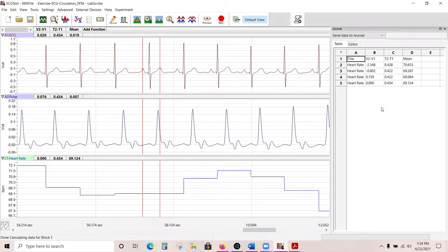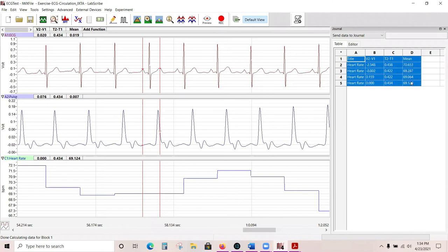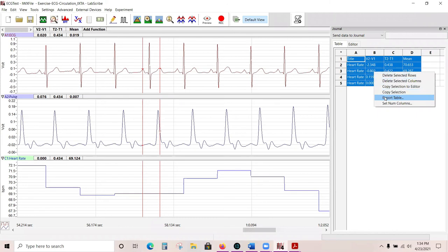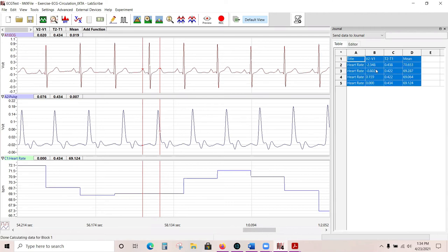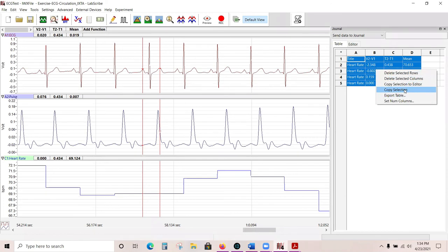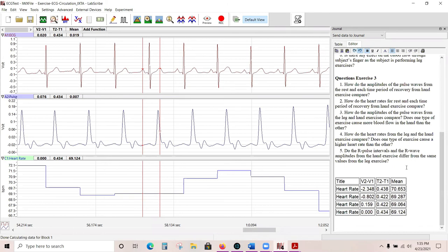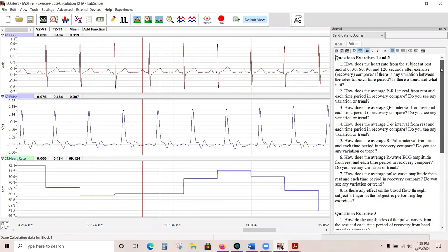Once you have a data table, you can highlight it, right-click, and export it to Excel. You can copy it to the editor, giving you a nice data table that goes along with the questions and answers from your students. You can also copy the selection and paste it into Word. If students answer the questions directly in the journal, they can print the journal with their answers, their data table, and the image of their data—all of this goes in the journal and it is a very powerful feature.